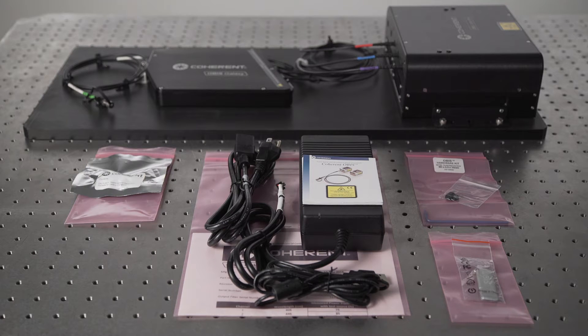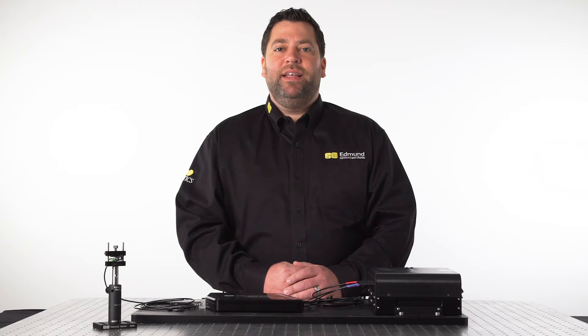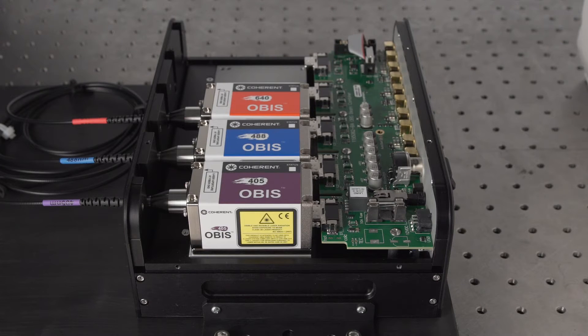Everything you see here is included with your purchase of the Coherent Galaxy laser system. The system is comprised of five components: the Galaxy laser box, the laser beam combiner, and three OBIS lasers.